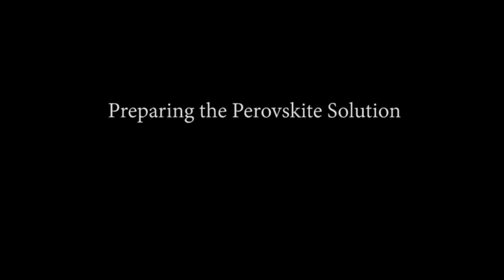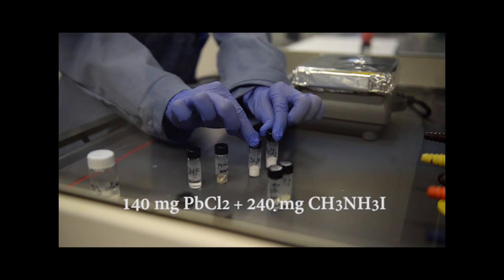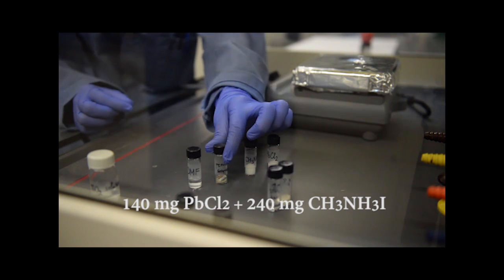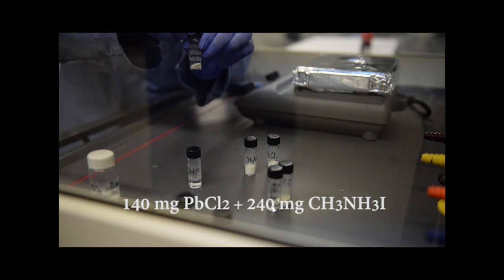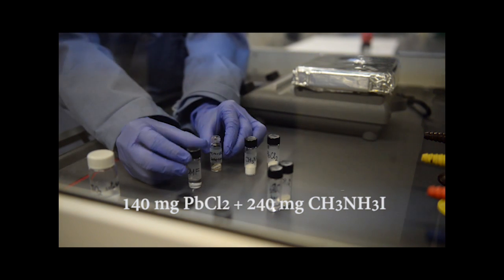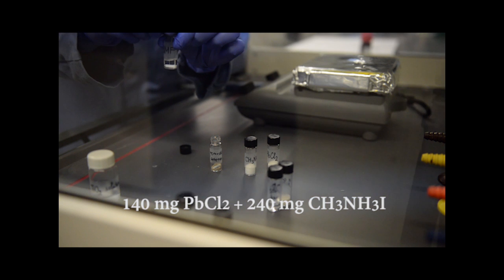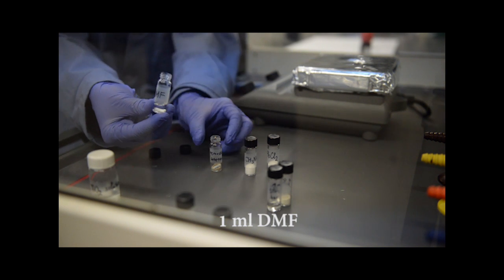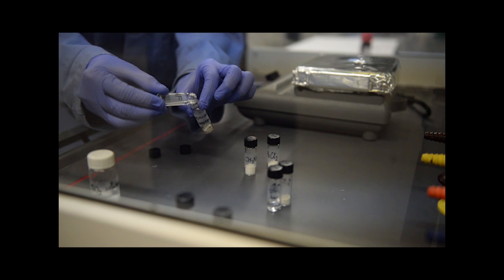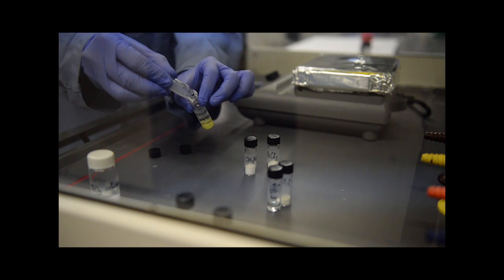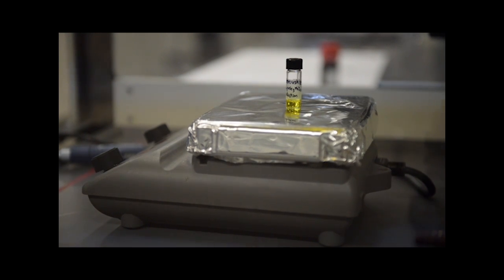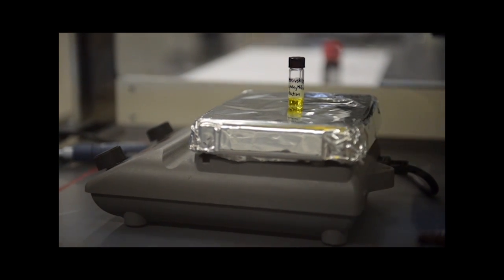The second solution we have to prepare is the light-absorbing material perovskite. To make a 0.5 molar perovskite solution, we will need to mix 140 milligrams of lead chloride and 240 milligrams of methyl ammonium iodide in 1 milliliter of dimethylformamide solvent. The resulting reaction needs to be stirred at 80 degrees celsius until a homogeneous yellow and transparent solution is formed.